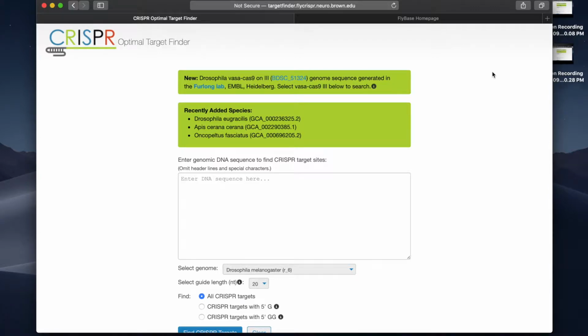In this video tutorial, I am going to show you how to find Cas9 target sites in Drosophila using CRISPR Optimal Target Finder.